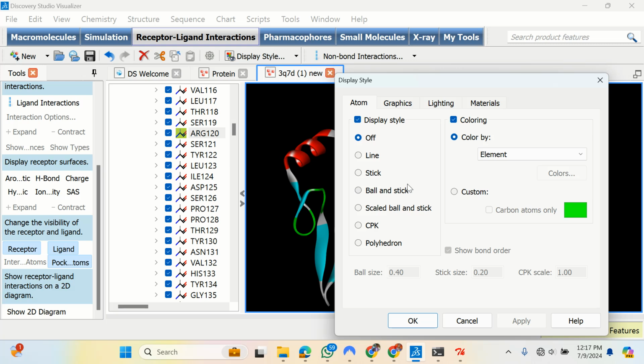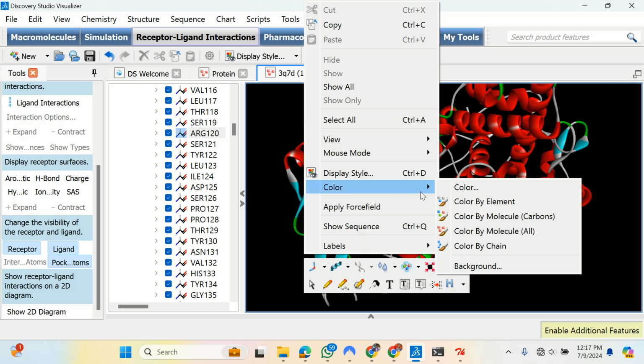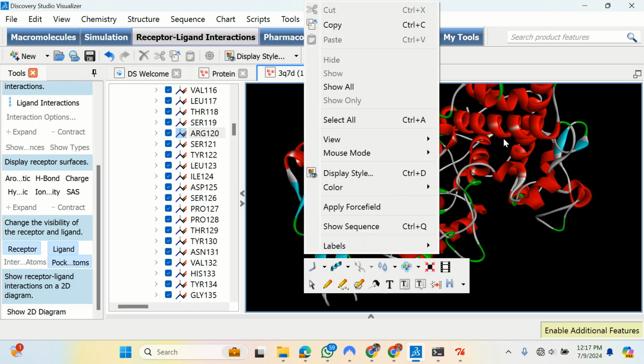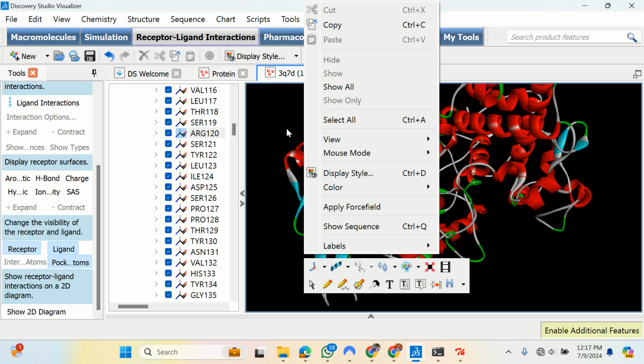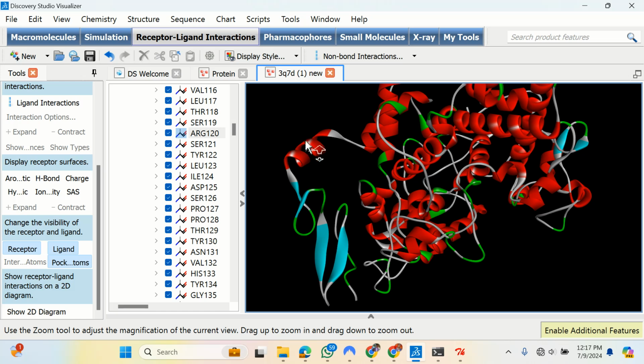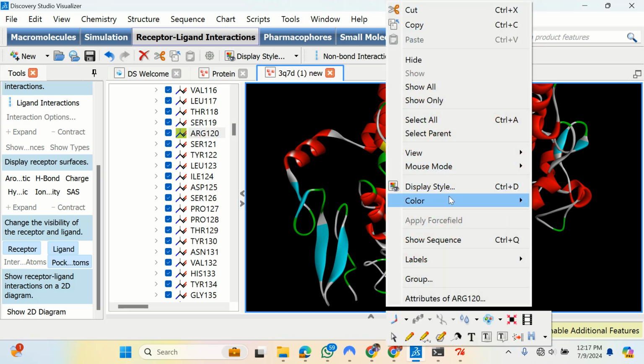So if you mistakenly highlight this way, and then you click here and you start doing like this, you are already doing another thing. Did you get what I just said? I was saying that remember we highlighted this and then this got highlighted before we now right click to change the display style.